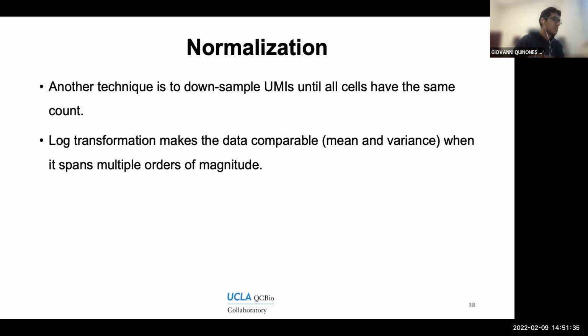So you can have certain genes that have 0 to 10 counts, very few, very lowly expressed. And then you can also have other genes that have hundreds or even, well, thousands is a little bit of a stretch, but like hundreds of reads mapping to that particular gene.